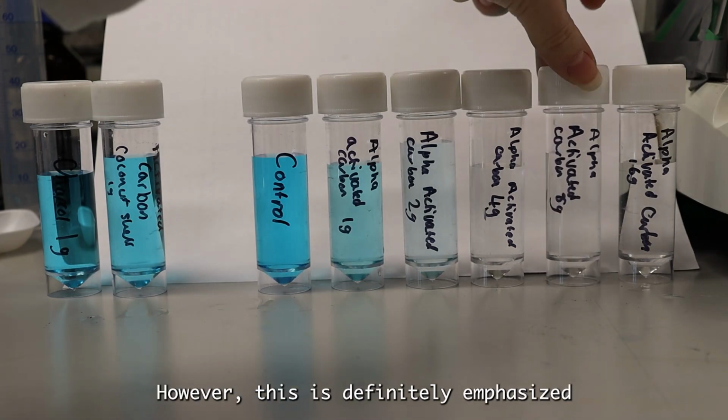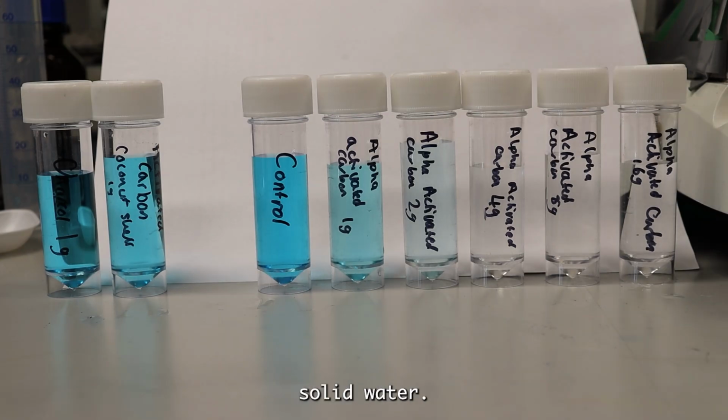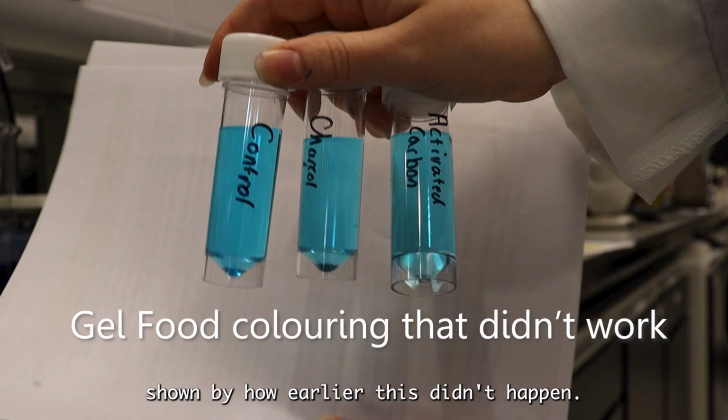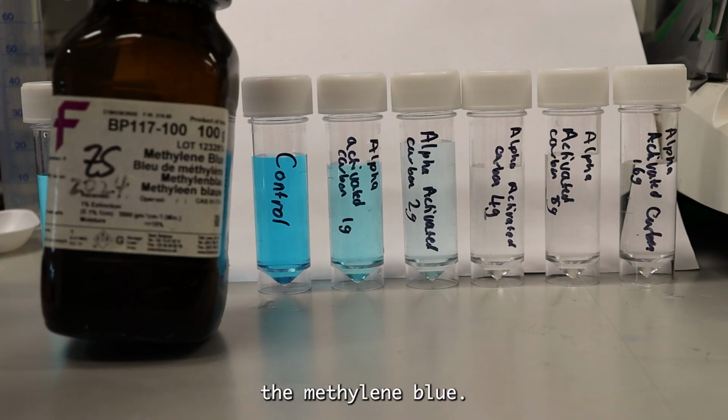However, this is definitely emphasised by the 8 grams and the 16 grams. These two just look like solid water. This may be different for different brands of activated carbon and will definitely be different for different food colourings and dyes, shown by how earlier this didn't happen when I used the gel food colouring, but this did work when I got out and diluted the methylene blue.